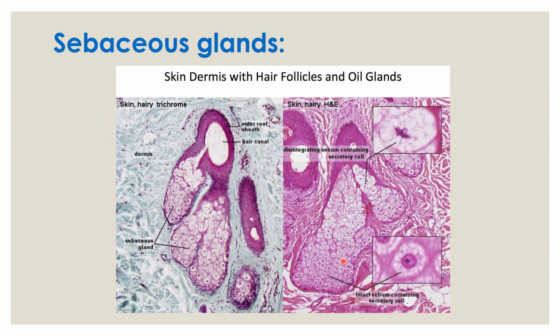So these cells of the sebaceous glands are also called sebocytes, and they are filled with small fat or lipid droplets, and their product is called sebum. It is actually a complex of lipids and includes wax, cholesterol, and triglycerides, which are hydrolyzed by the enzymes and the bacterial enzymes after their secretion.